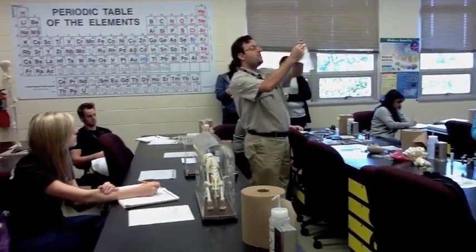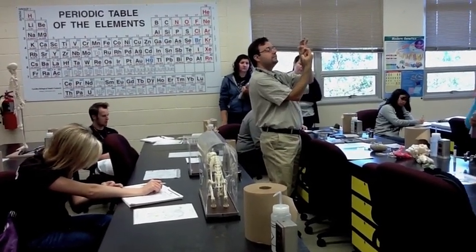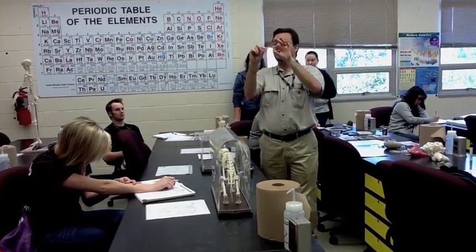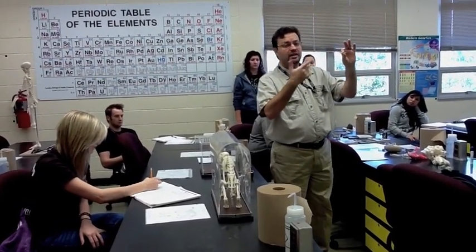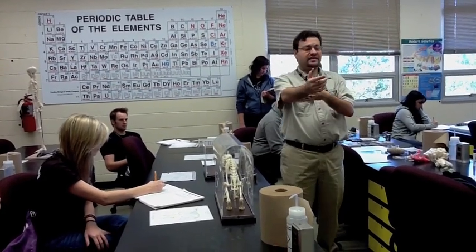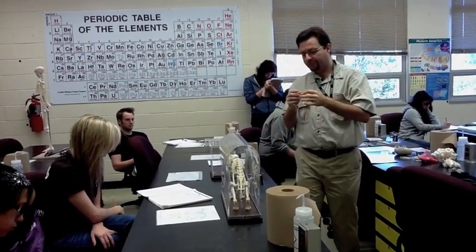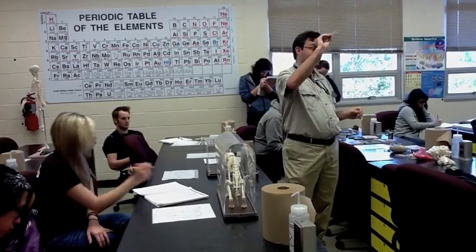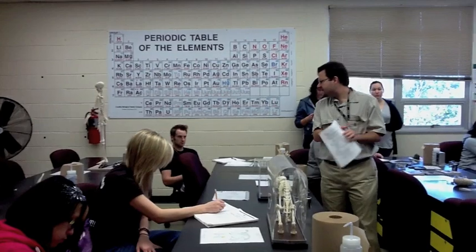On the frog's arm, you can still see the line right here. Because of the way the frog jumps, it puts a lot of pressure on its front legs whenever it lands. So they ended up having to fuse their radius and ulna together so that there wasn't separation of the bone on landing. So this bone is called the radial ulna. And I'll tell you again, this one likes to make it on the practical a lot. What else?